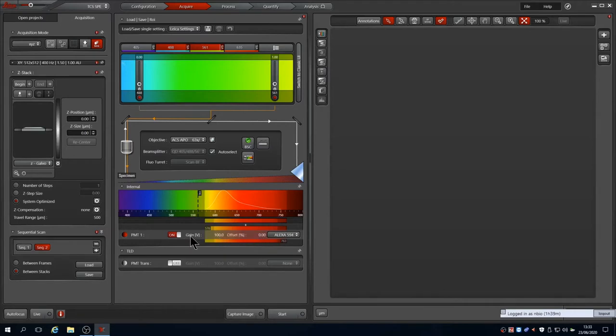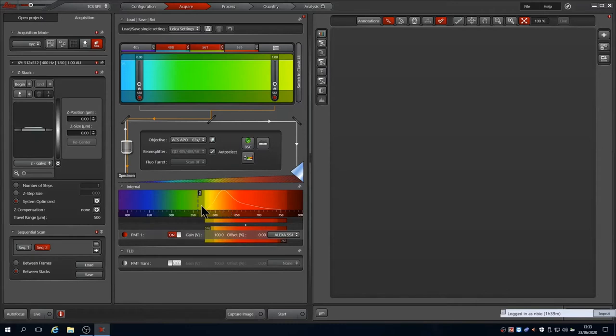The gain is set to 100 volts by default, which is too low for most imaging. There is also an offset on the PMT to adjust the noise discrimination, but this should normally not be required. The icon for the PMT is also coloured to match the pseudo colour that the system has chosen for the channel.